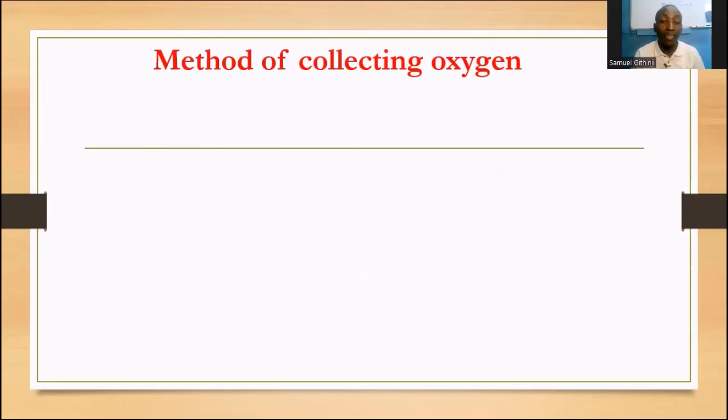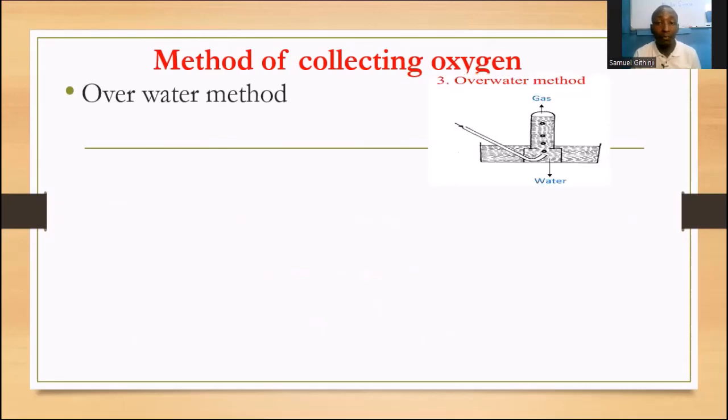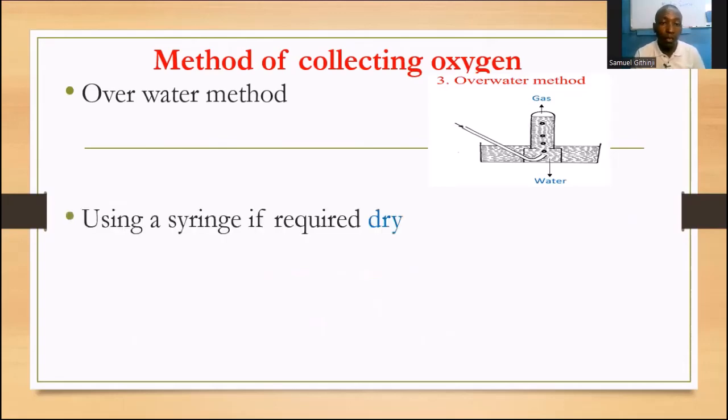So how do I collect the gas? I can use the over-water method in case I do not require it dry. Why do I need to use this? The gas is slightly soluble in water. Good, I can use a syringe in case I require this gas dry. That is it.